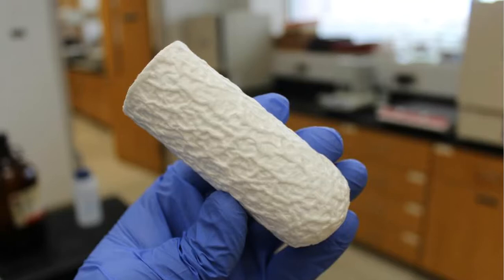All right, so now I'm going to get a Soxhlet thimble. Just like the thimble that goes on your thumb when you're sewing, it kind of helps protect your thumb, right? So this is going to, in a way, help protect our sample. It's going to give us our little capsule that our peanuts are going to go down on the inside, and this keeps everything nice and tidy in the Soxhlet extractor so it doesn't get messy and it doesn't jam up the drainage tubing and so forth on the side of the Soxhlet. So that's why we use the thimbles.